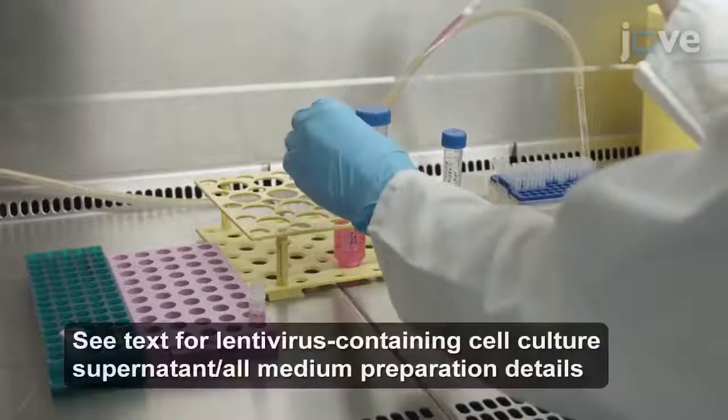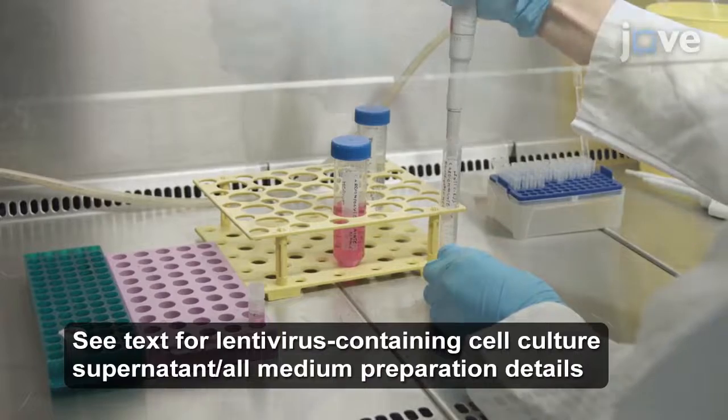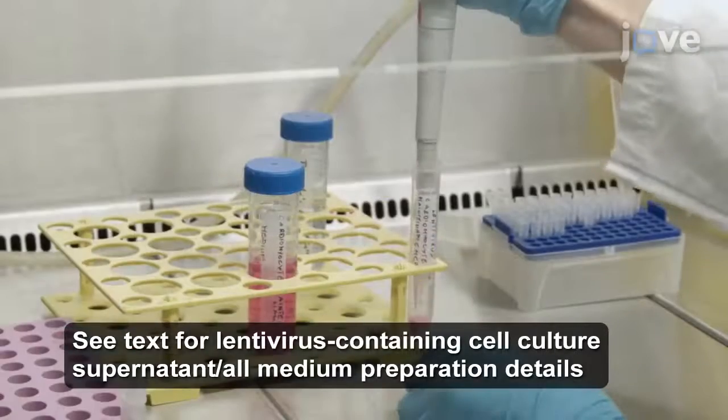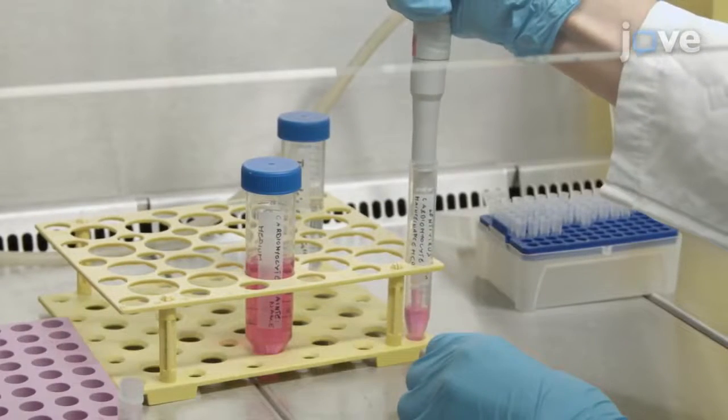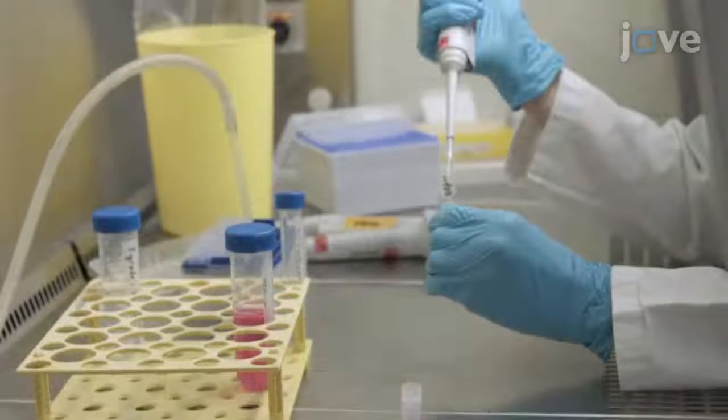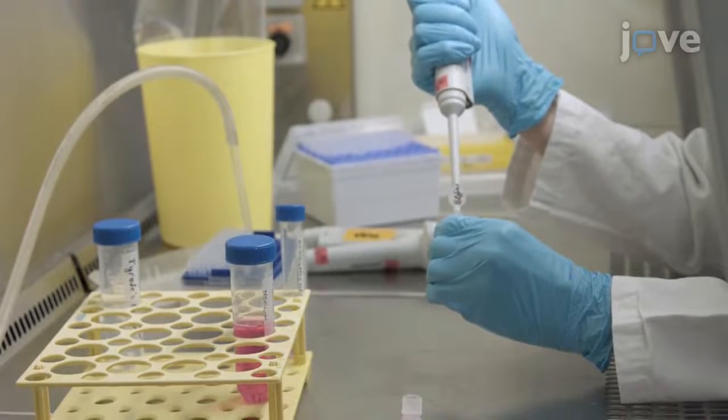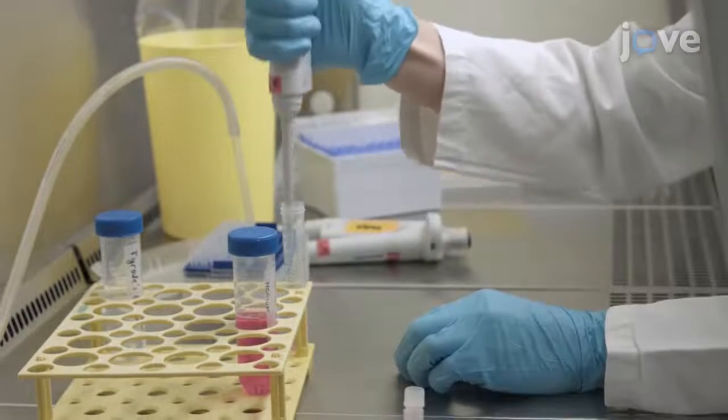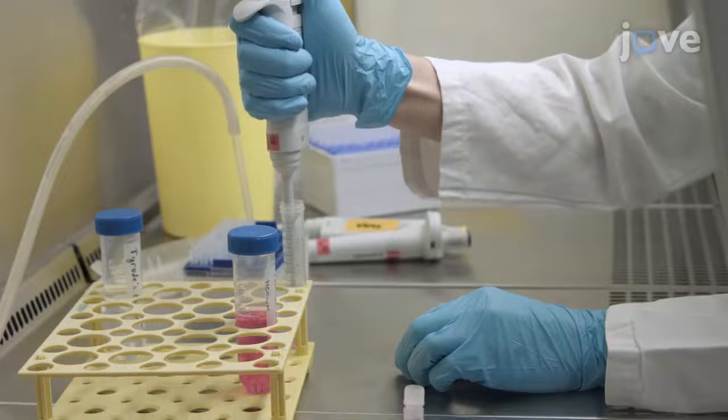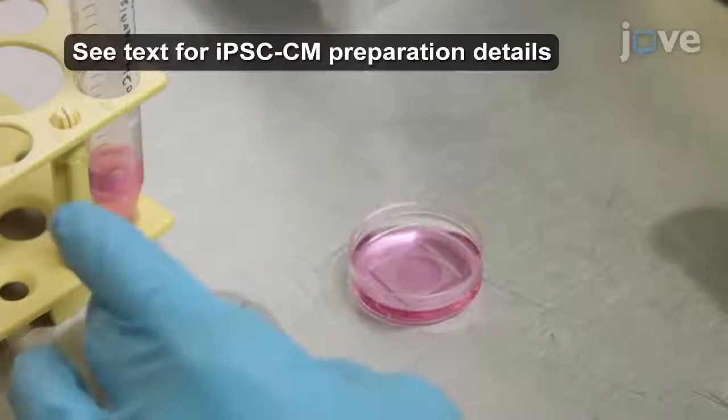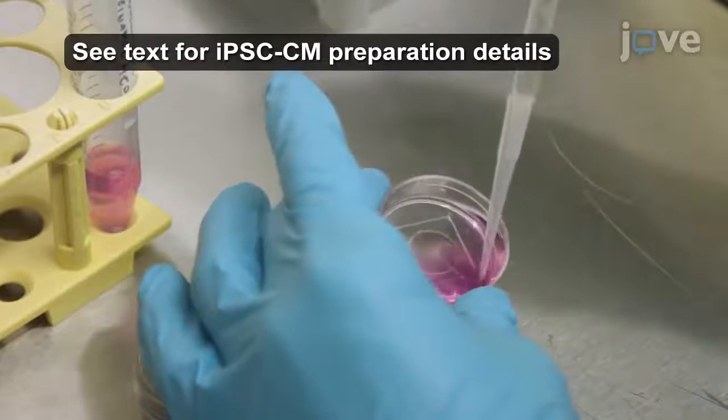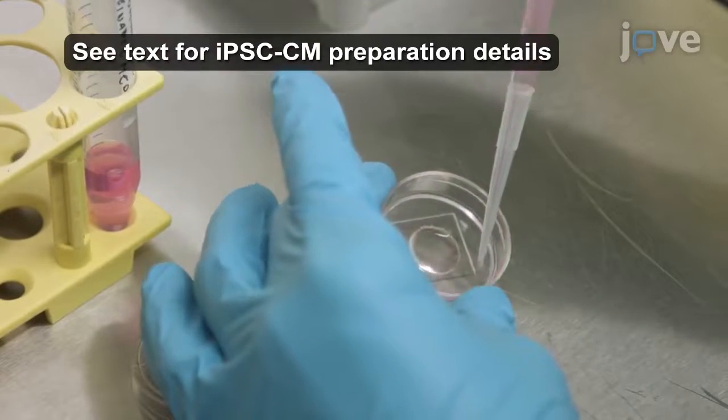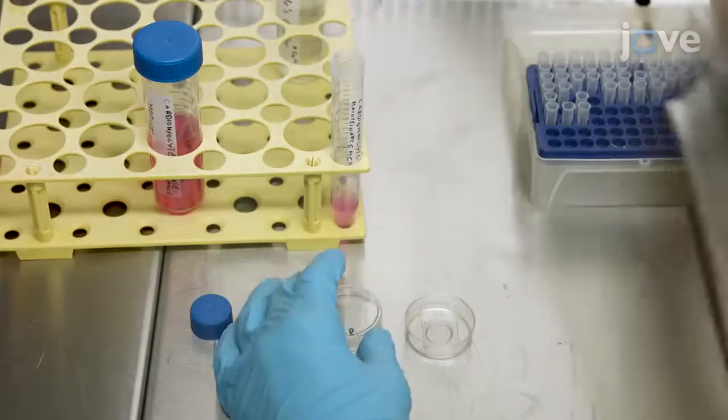Begin by mixing lentivirus-containing cell culture supernatant with cardiomyocyte maintenance medium at a 1 to 1 ratio. Add hexadimethrin bromide at a final concentration of 8 micrograms per milliliter to enhance the infection efficiency, and replace the cardiomyocyte maintenance medium in the IPS cell-derived cardiomyocyte culture dish with the infection medium.